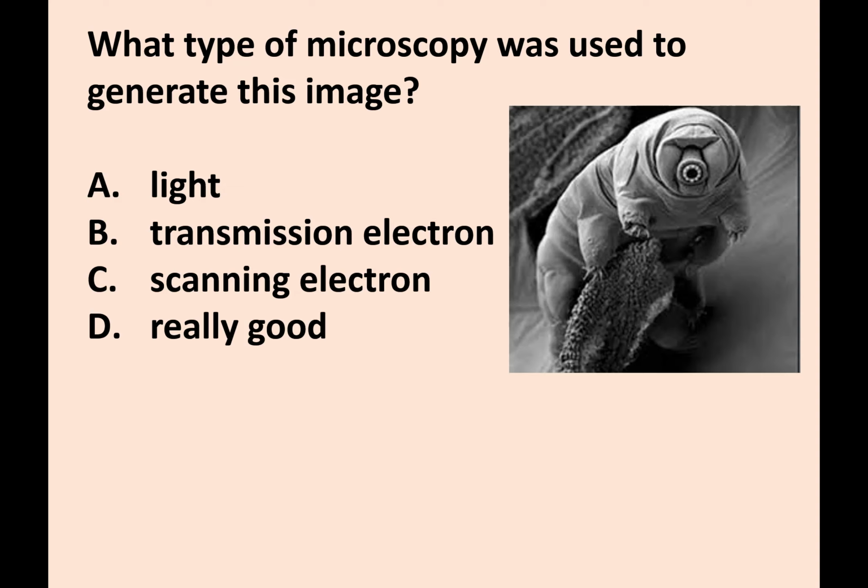What type of microscopy was used to generate this image? So you're seeing this cool 3D looking kind of monster, right? This is made from a scanning microscope because you can see the outside of this.